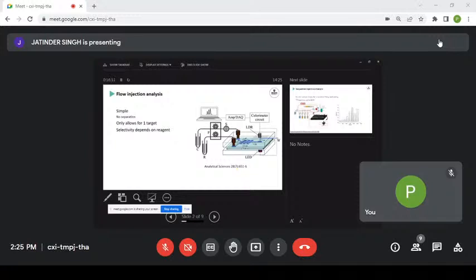LEDs, you can get them in a whole range of different colors. So if you know the wavelength that your analyte is absorbing at, you can go to a catalog and for $1 or $2 get an LED that matches that spectrum. Then with a photodiode, you can actually measure the current of the amount of light coming through, and very cheaply you can develop your own photo detector.